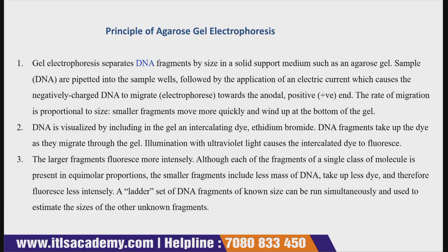So depending upon the size, the particles that are small move more quickly towards the bottom of the gel, and the particles that are larger in size move less quickly, meaning they move after all the small molecules have migrated.